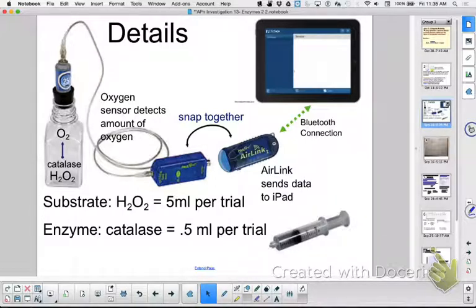And you have 2 syringes sitting like this because you don't want to contaminate them. I don't like what Team 1 did, because do you see how I put the syringes in here up? What did they do? Put it down. And if it happened to have the hydrogen peroxide in there, do you see how it could be contaminated? So I would rinse off the end of your syringes and I would store them like this.